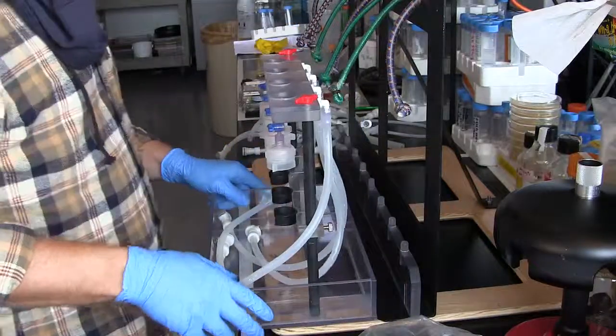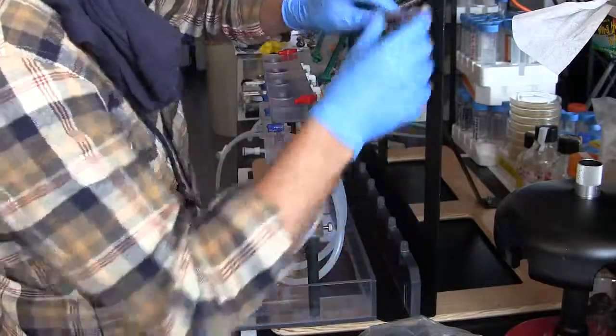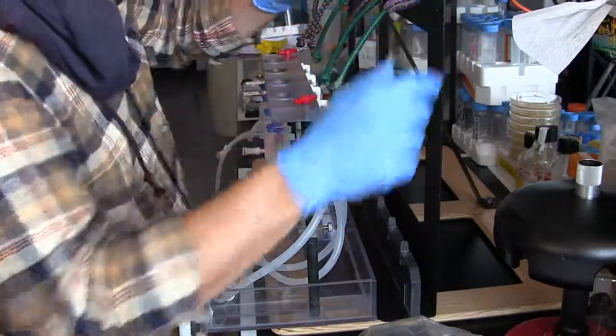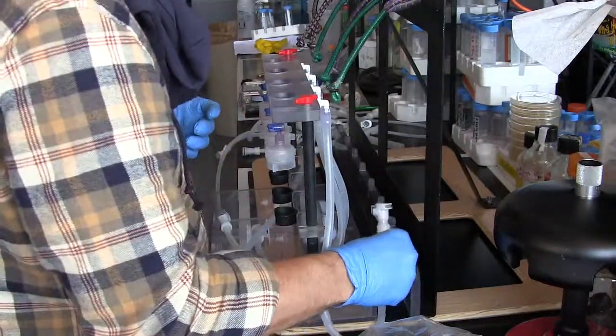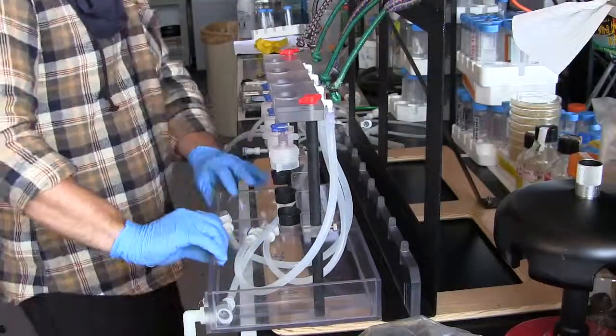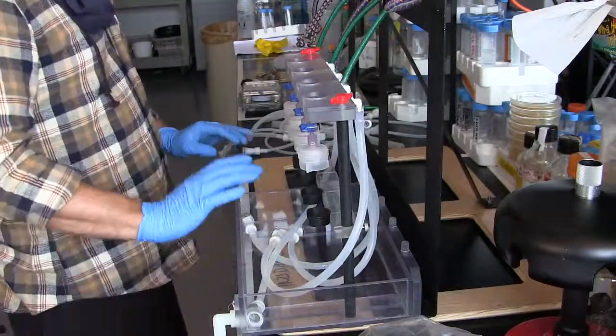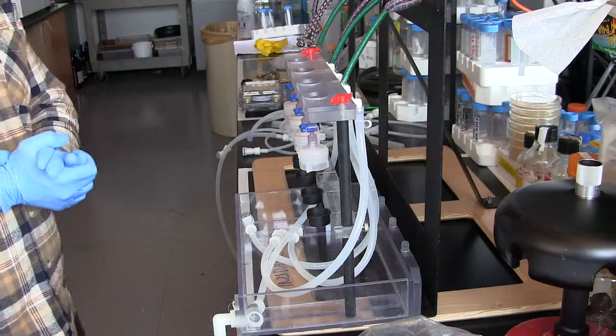Okay, when you're actually running the water chemistry set, the Niskin bottles will sit here, slotted onto here, and they'll be held in with a bungee, like so. You then just take this piece and attach it to the Niskin at the bottom, so water can then flow down through. Okay, so that's that part of the setup, and that's where we'll stop for today.